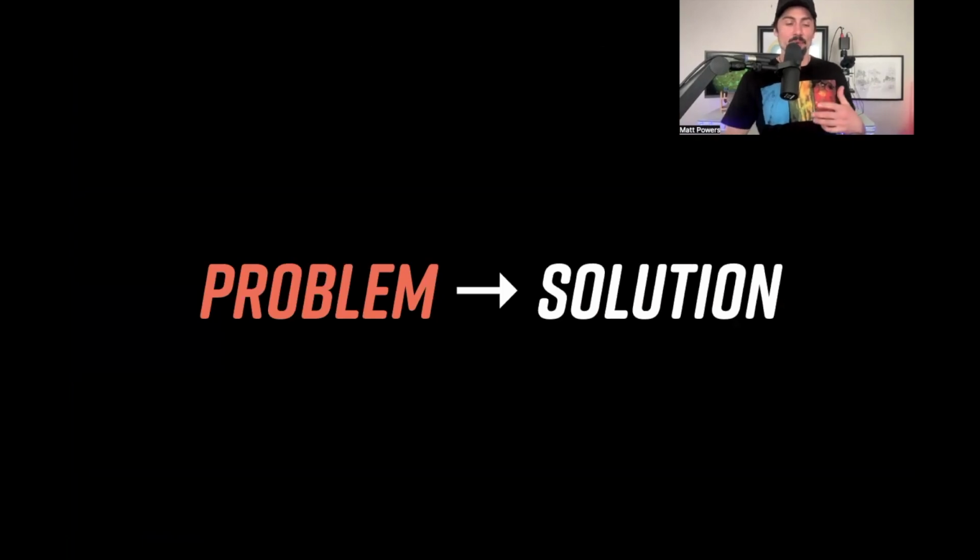And many of us know about a problem that we're facing. Many of us know about the obstacles we're facing. Maybe it's on your farm. Maybe it's about soil in general. Maybe it's about topsoil loss. Maybe it's about nutrient deficiency. Maybe it's about biological deficiency. We may know about these problems. And microscopy is a powerful way to find those solutions, verify those solutions, and make sure those solutions are still solving those problems. Because things can change over time.